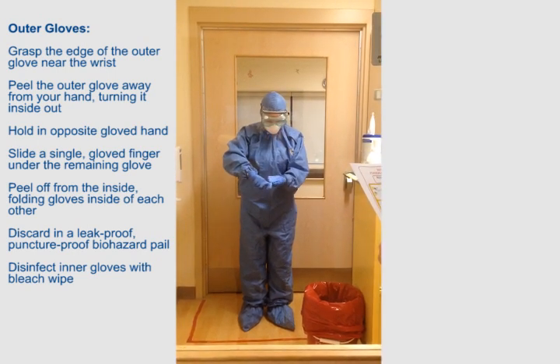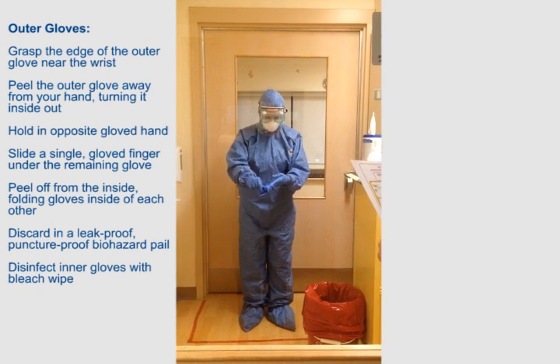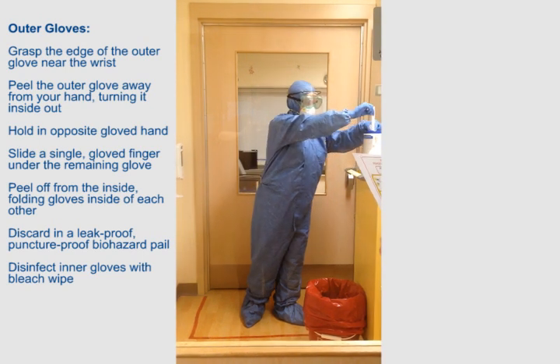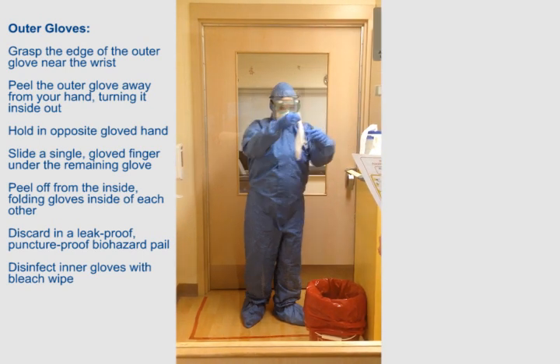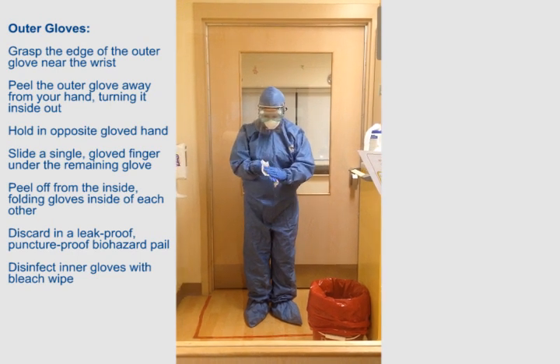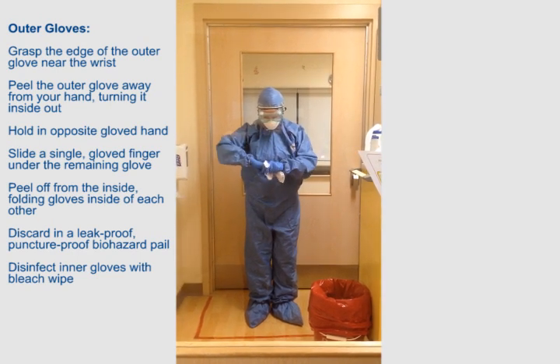Slide a single gloved finger under the remaining glove. Peel off from the inside, folding gloves inside of each other. Discard in a leak-proof, puncture-proof biohazard pail. Disinfect inner gloves with bleach wipe.